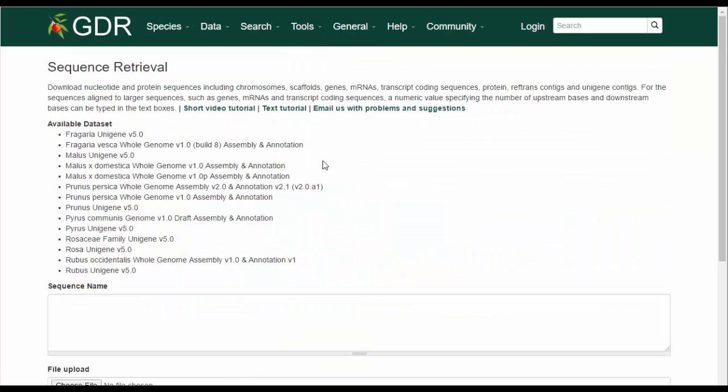The Sequence Retrieval tool allows you to download nucleotide and protein sequences, including full chromosomes and scaffolds, genes, full transcripts, transcript coding sequences, proteins, RefTrans contigs, and unigene contigs.